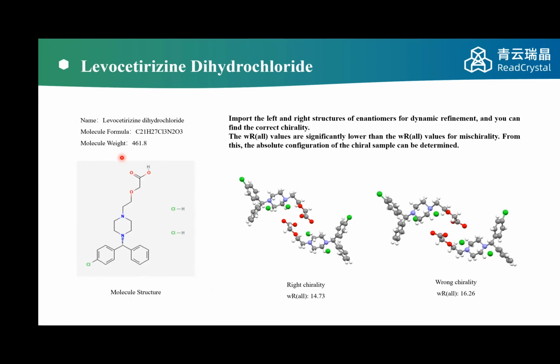This is one example. The absolute structure of this molecule is determined by micro-ED. How do we do this?